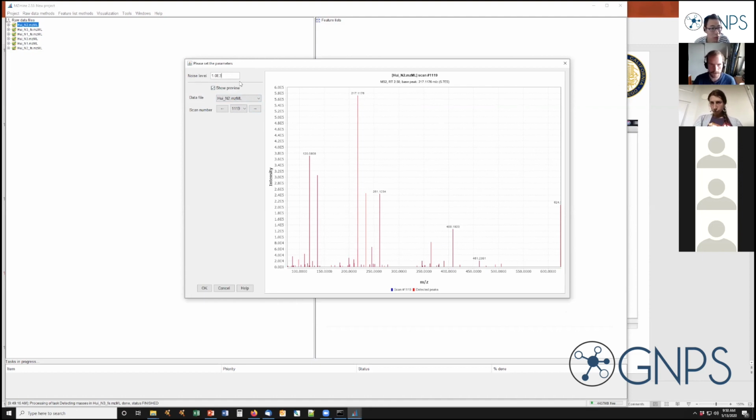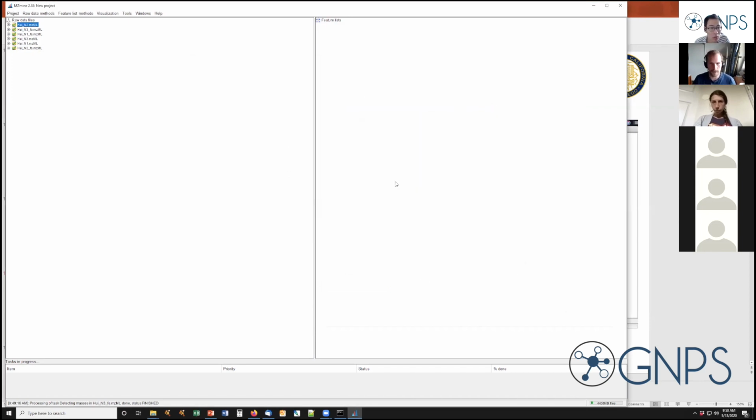Daniel, can you show the last bit again? Somebody just asked. Sure.